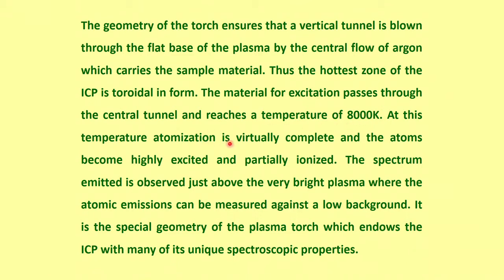At this temperature atomization is virtually complete. That means whatever sample you introduce just gets converted into vapor and then atoms. But if the sample is not converted into a fine droplet, bigger droplets remain, and they fall back down into the system through gravity.